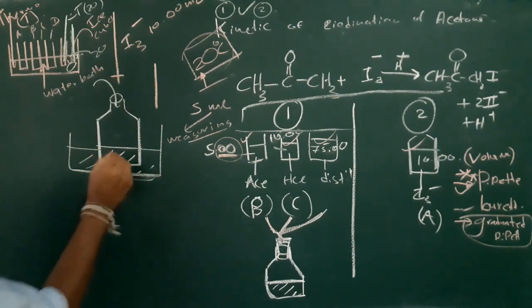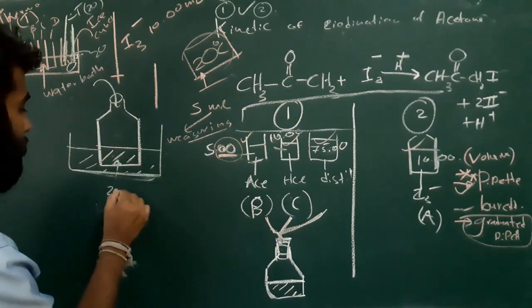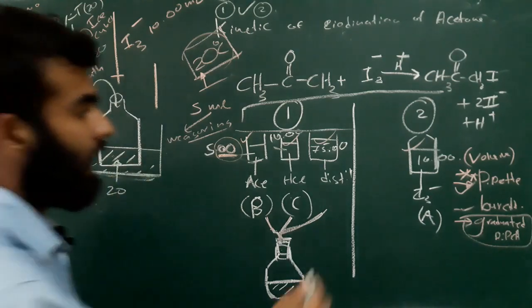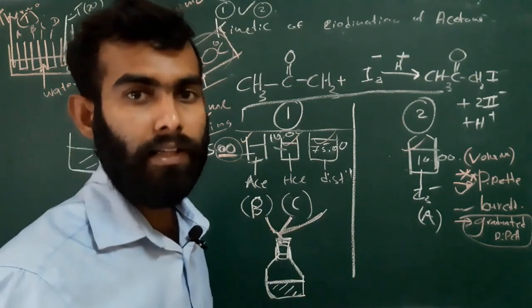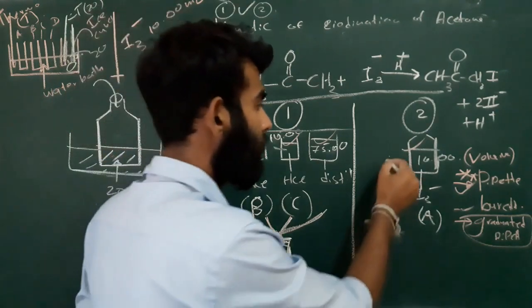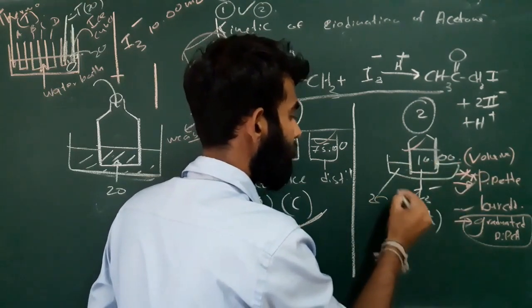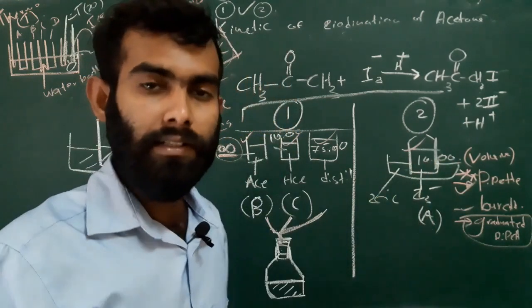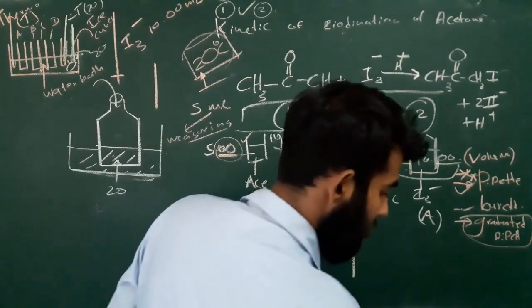Now this reactant mixture is in 20 degrees. So the iodine solution, this also should be in the water bath. Before mixing, it also should be in the water bath with 20 degrees. After that we can start the reaction. Okay, these are the basic things you have to remember.